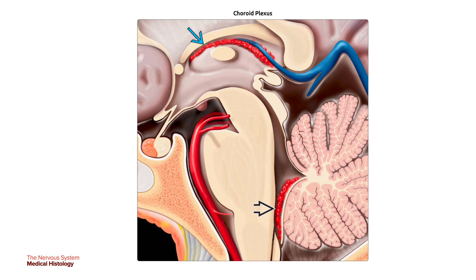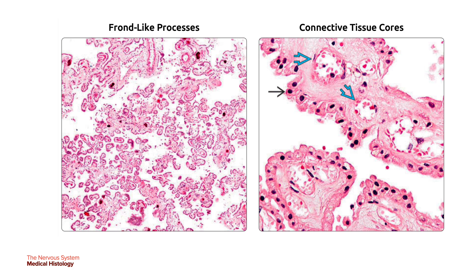This graphic shows the sites of the choroid plexus in the brain, including the roof of the third ventricle in a single blue arrow and the fourth ventricle in a bold black arrow. On the left is a low-power view demonstrating the papillary frond-like processes. The papillary architecture of the choroid plexus is characterized by frond-like processes of vascular leptomeningeal tissue projecting into the ventricular lumen. On the right, the cores of loose connective tissue and dilated blood vessels are covered by a single cell layer of modified ependymal cells.